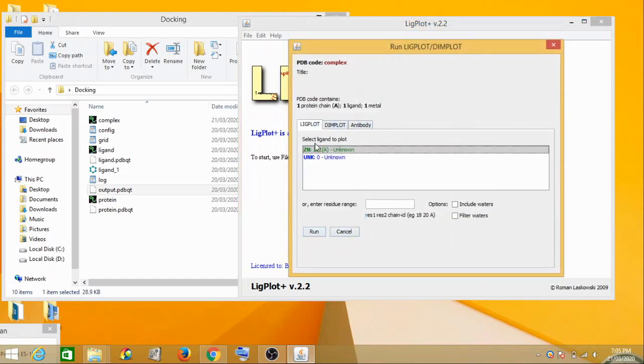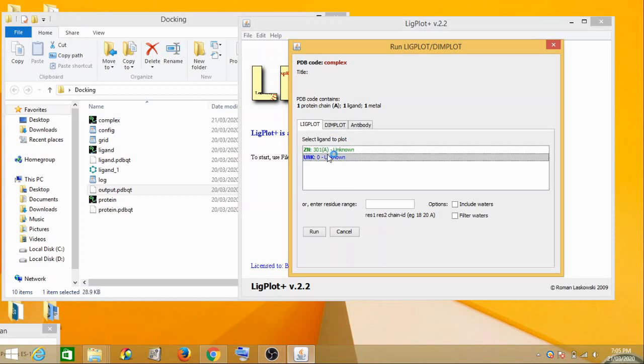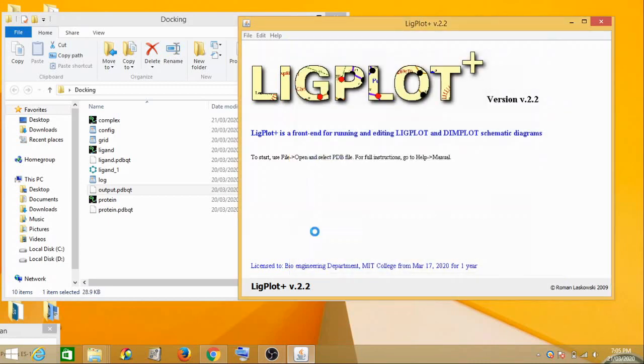All right, now this window will open where you would see LigPlot. Which ligand do you want to select? Now the Zn is an added ion which is there, and this UNK which you see, unknown, is the name of your ligand. So you select unknown because this is your ligand here, and then click on run.